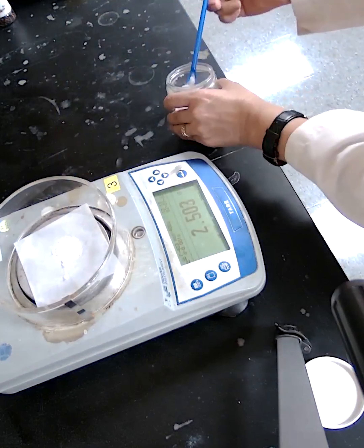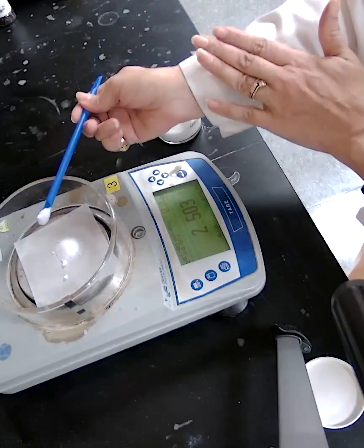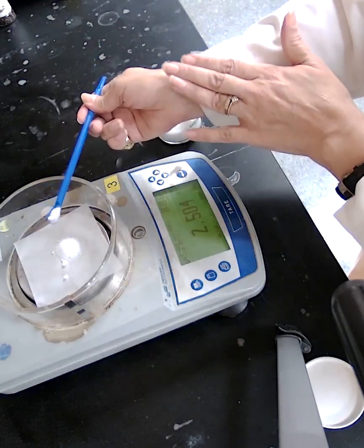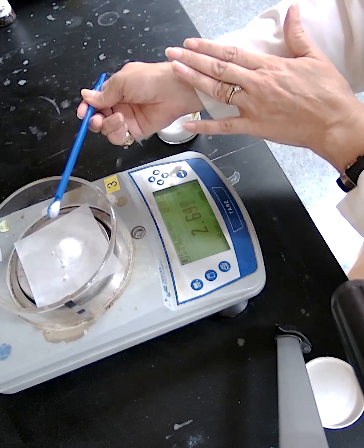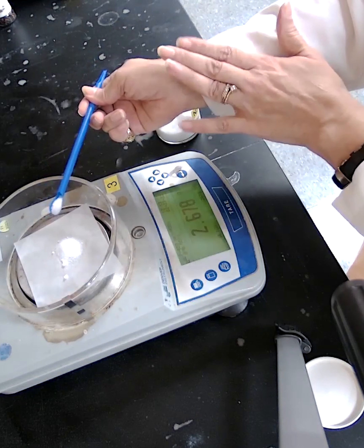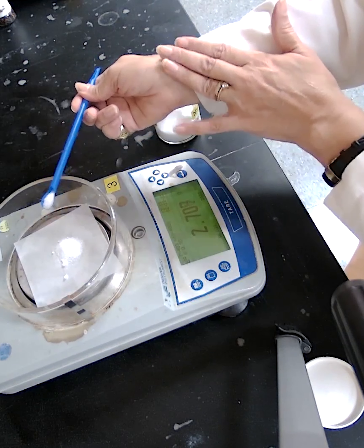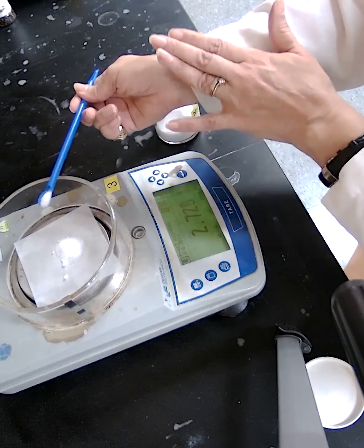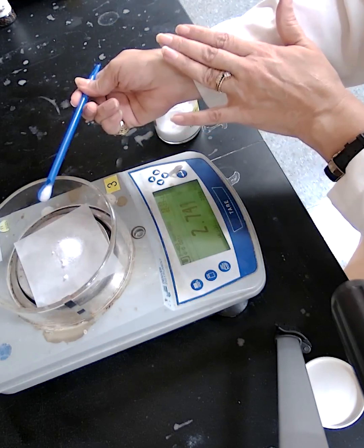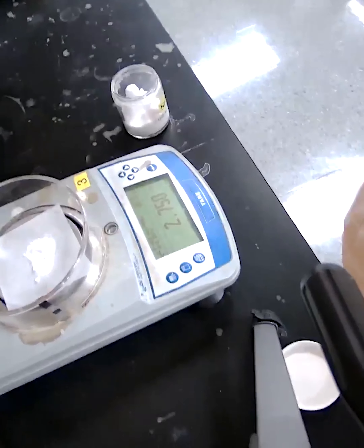When you get close to that number, try to add slowly — just one grain at a time — so you don't have to remove any excess. The target is 2.750 grams, and we stop right there at 2.750.